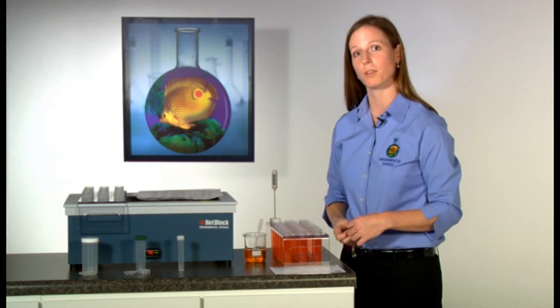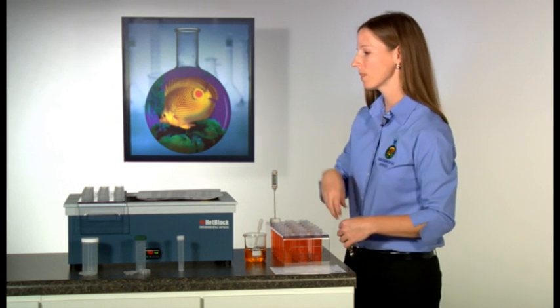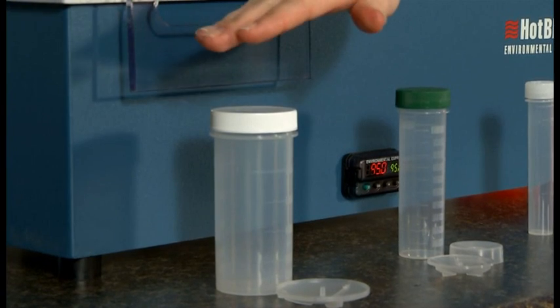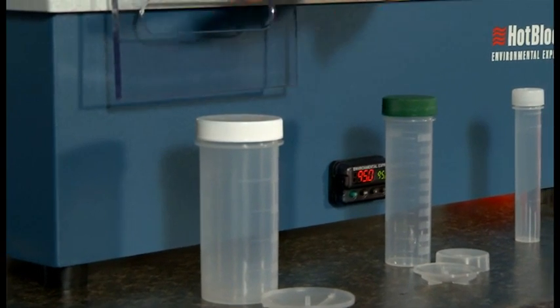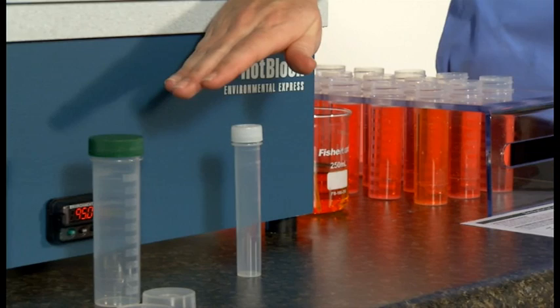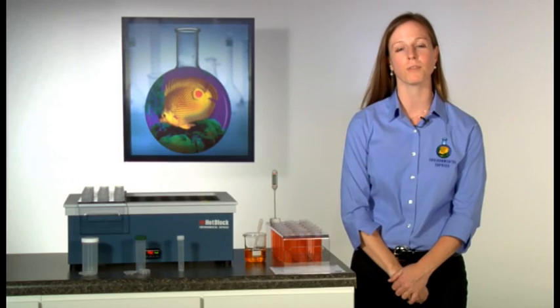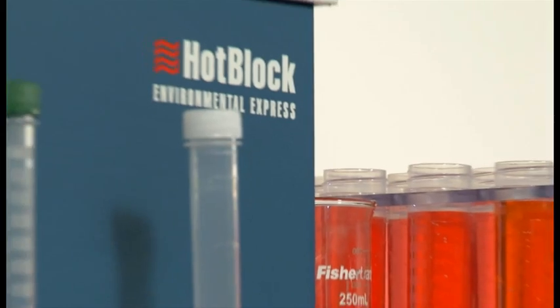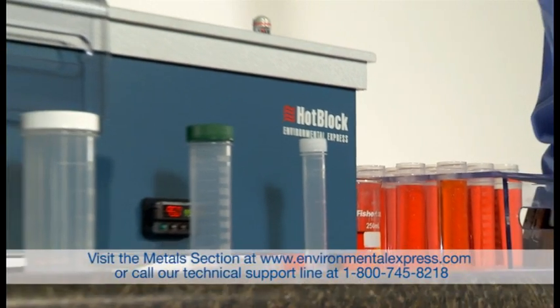There are a number of products recommended for use with each hot block. Our digestion cups and accompanying watch glasses are specifically designed for corresponding block well size, depending on your sample volume. You will find a number of filtration accessories as well as standards for use with our hot blocks on our website.